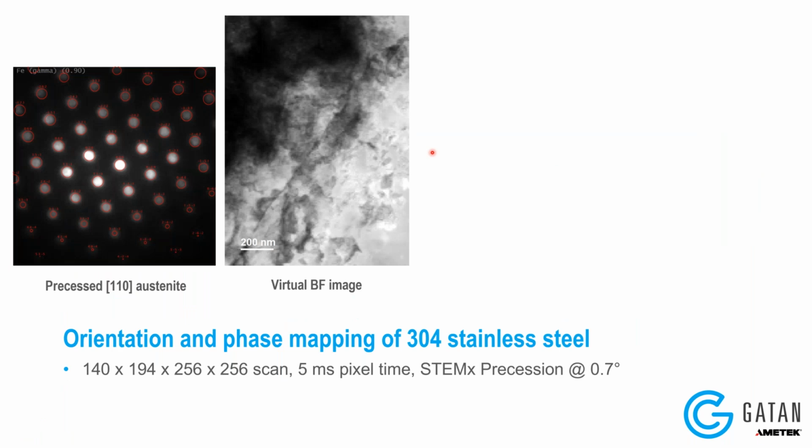And then something else that you can do again in 4D STEM that I think is really great, it's a new capability for Gatan and DigitalMicrograph, is ability to do orientation mapping and phase mapping.